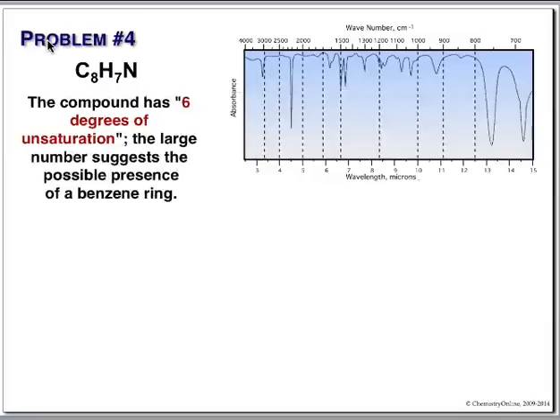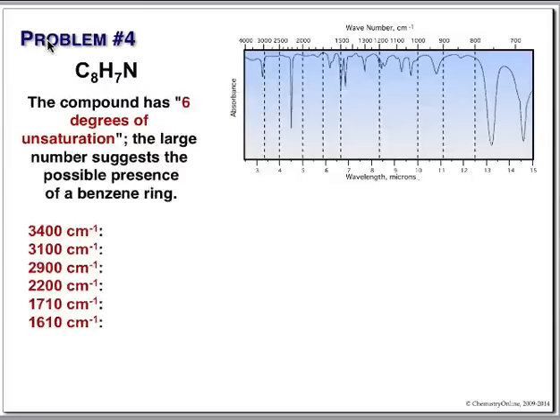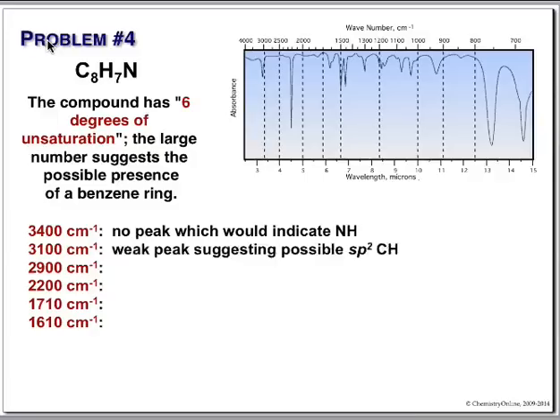Okay. My rule is, if you have more than 4, you really think benzene ring? Yeah, I would say so. Look at your spectrum, 3400. See anything? Nope. 3100. Nice, clean, sharp peak right there. That's good, isn't it? 2900. Nothing.